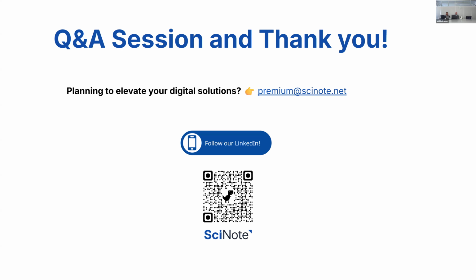Carlos, could you maybe mention how you would like to see any kind of AI features or functionalities? What would you want to see in ELN inventory? Yeah, sure. Carlos, you can also send me an email. We just talked recently, but you can send me an email. So Blaszka asked if you can explore and elaborate a bit.